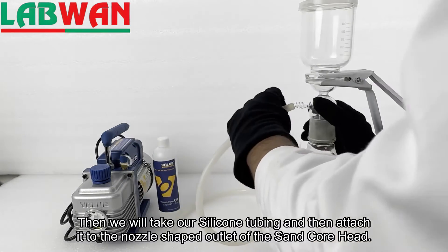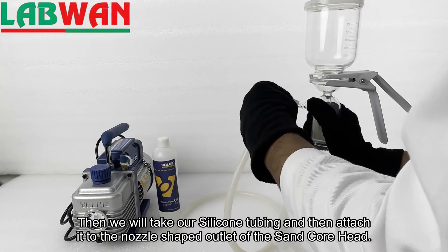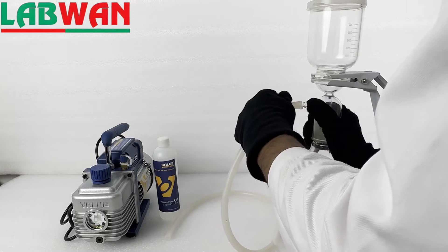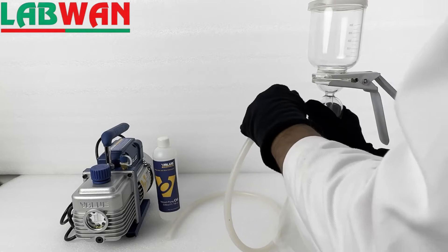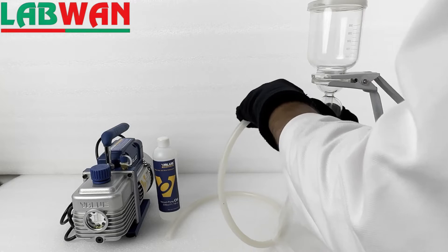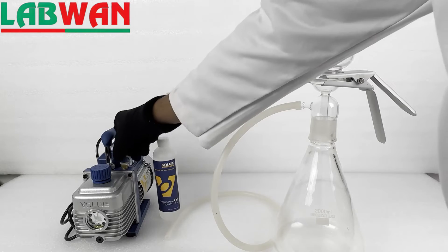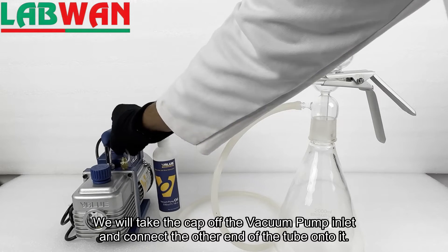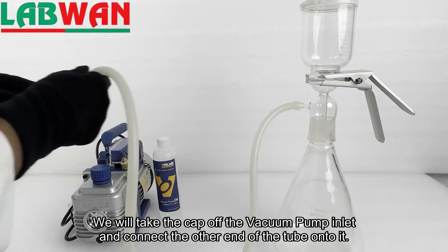Then we will take our silicone tubing and attach it to the nozzle-shaped outlet of the sand core head. We will take the cap off the vacuum pump inlet and connect the other end of the tube onto it.